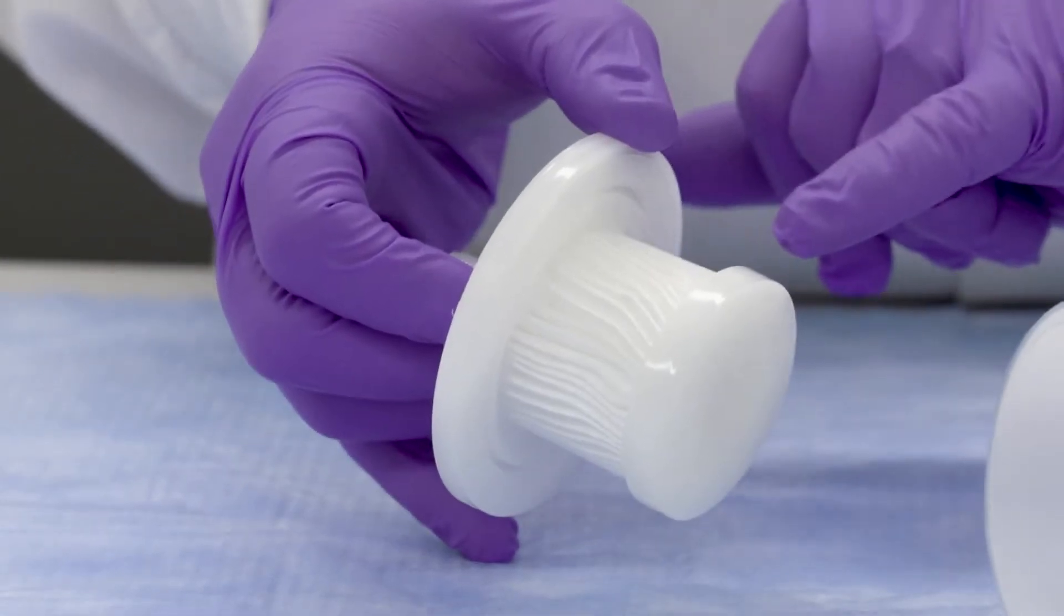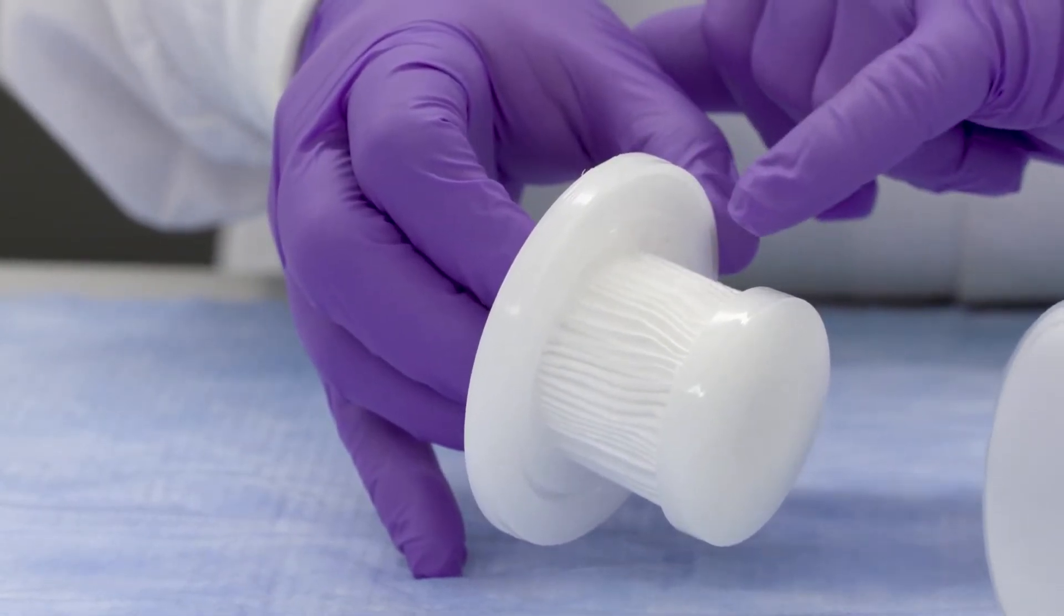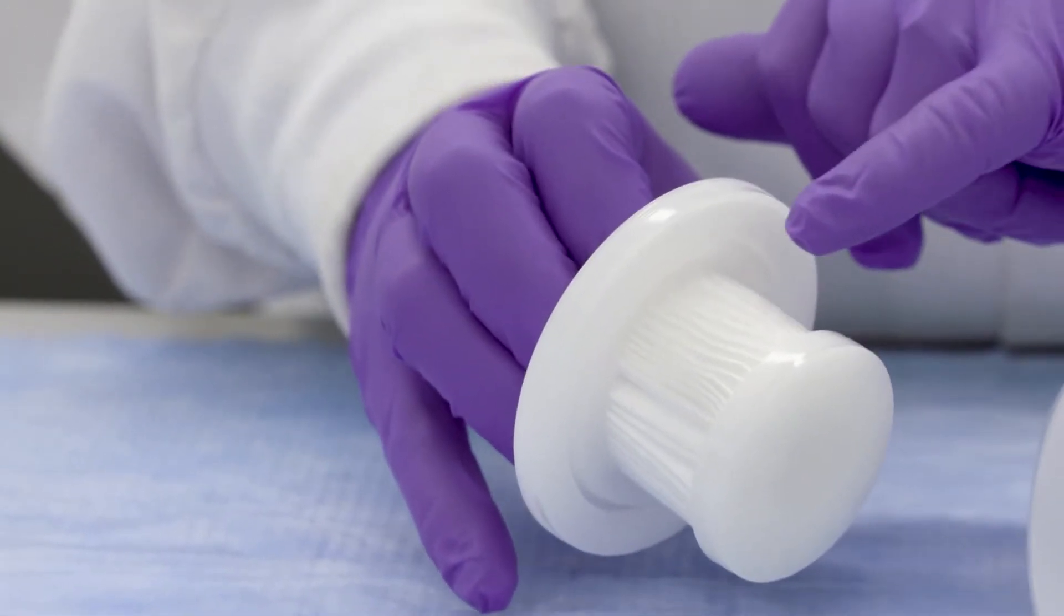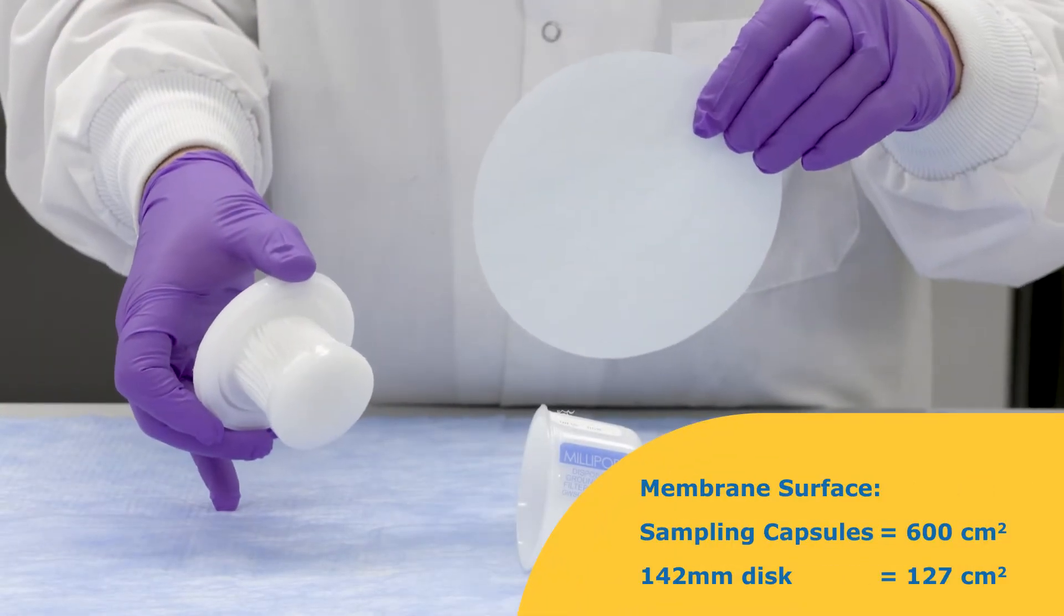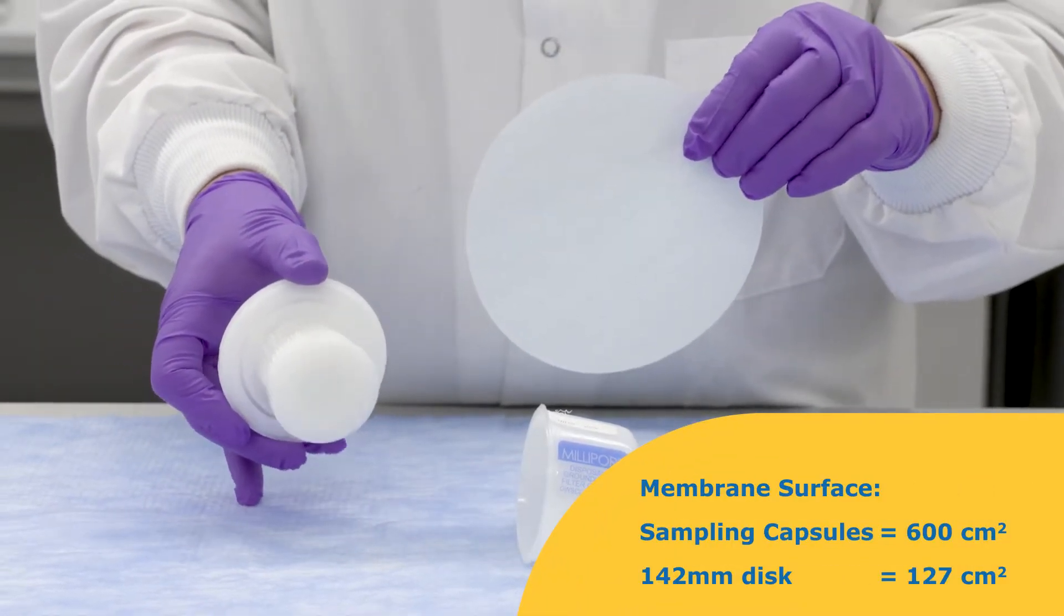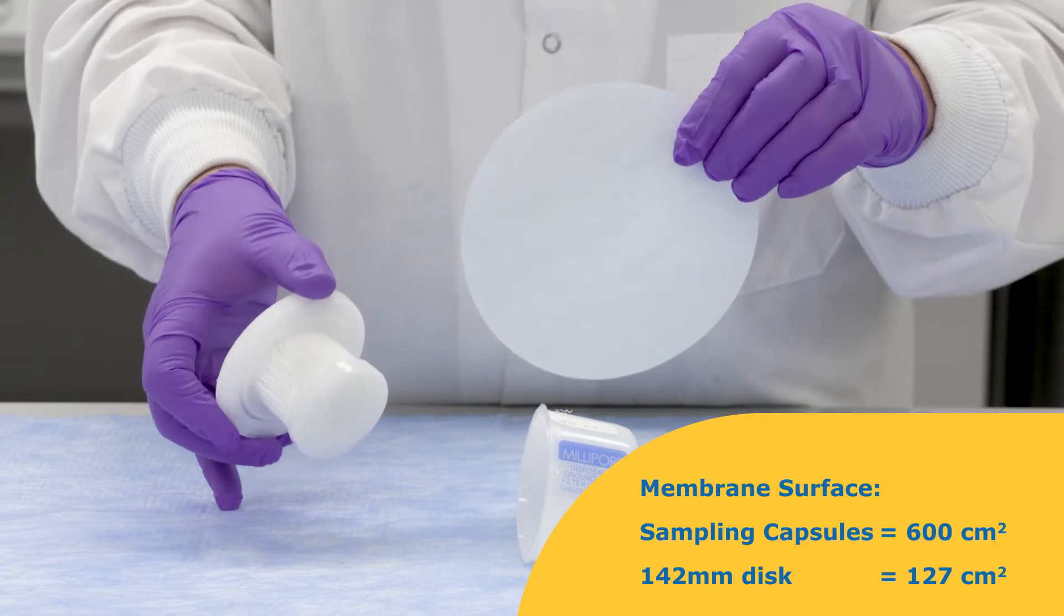Pleating allows greater membrane surface area to be fit into the housing. Here the sampling capsule allows 600 square centimeters of available surface area, about 4.7 times more than the recommended minimum filtration area compared to a 142 millimeter disc which contains 127 square centimeters.